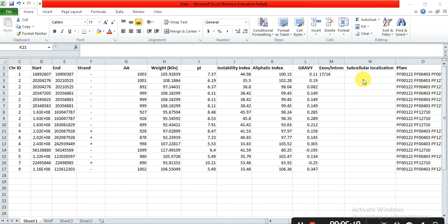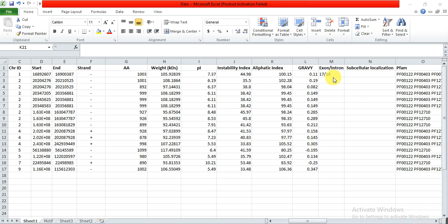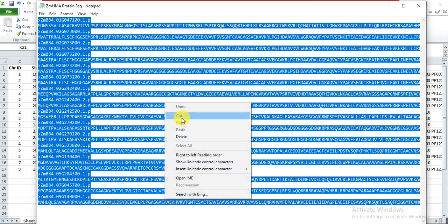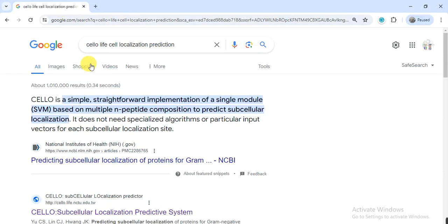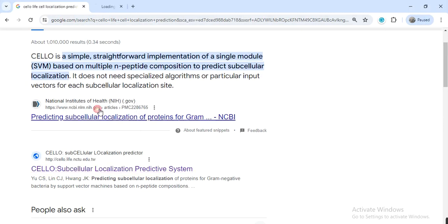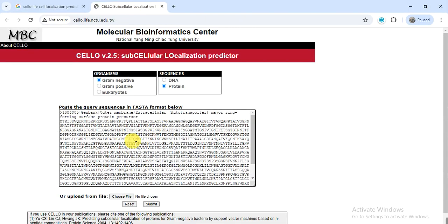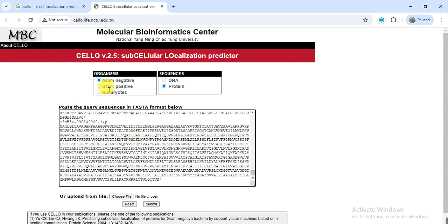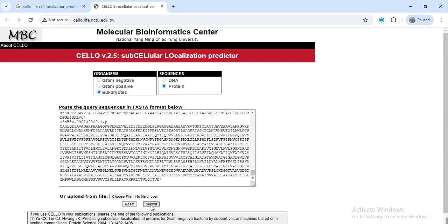After filling in the exon and intron columns from that figure, you will then determine the subcellular localization. For subcellular localization, copy the protein sequence, go to Google, search for 'subcellular localization prediction,' and open the Cell-PLoc or sub-cellular localization link. Delete any existing sequence, paste your sequence, select Eukaryote because our sequences are from eukaryotes, not bacteria, and click Submit.